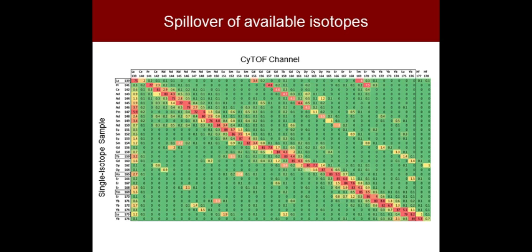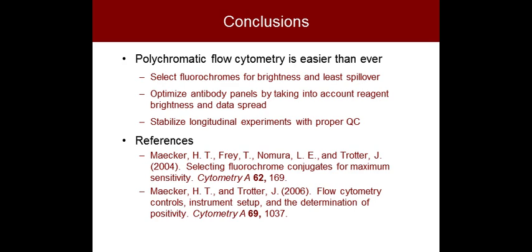I don't know anyone who actually does do compensation on the CyTOF. So, in conclusion, I would say the CyTOF, first of all, is a wonderful new platform. It's something that not everybody will have a need for or have access to in the immediate future, but if you do, it's a wonderful tool. But remember, it's not the solution to everything, and there are still some of these considerations of panel design that apply in terms of choices of where to place your different specificities.